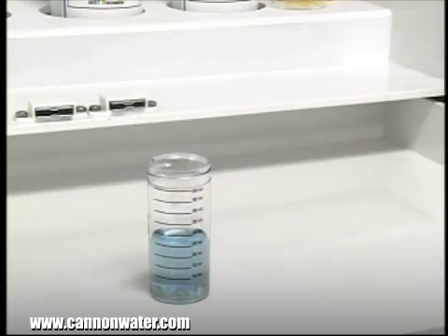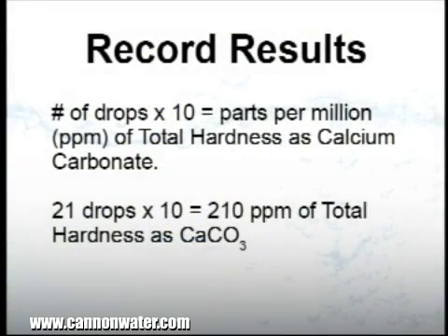In this example, each drop was equivalent to 10 parts per million of hardness. The sample took 21 drops to reach the endpoint, therefore this sample contains 210 parts per million of total hardness as calcium carbonate. This concludes our demonstration of the Total Hardness Drop Count Test Kit.